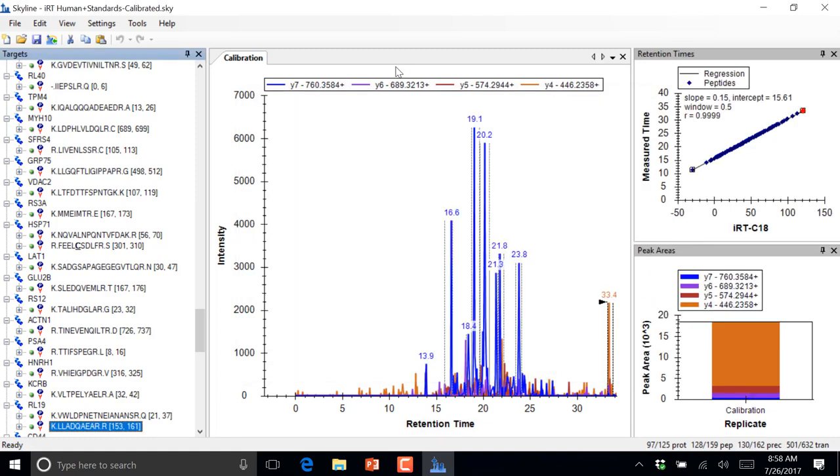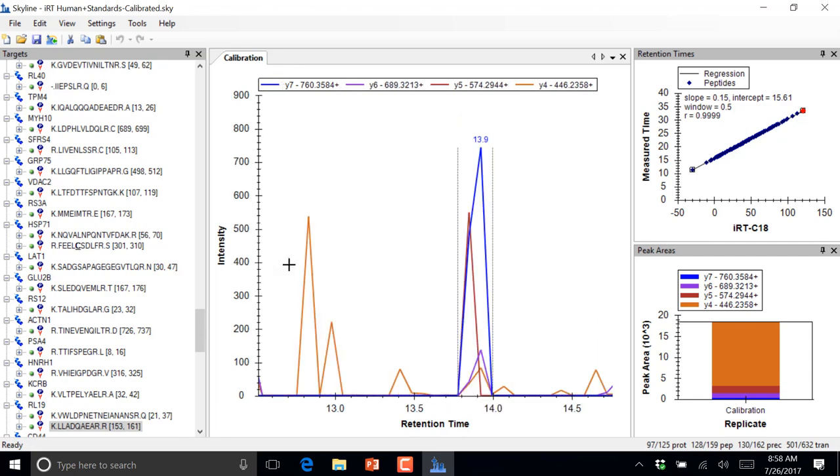So for that peptide, we're picking something out at 33, which is toward the end of the gradient. Oh, right, opposite thing. I got things backwards. So the person who did the experiment obviously picked something really close at the front of the gradient. And maybe this is it.